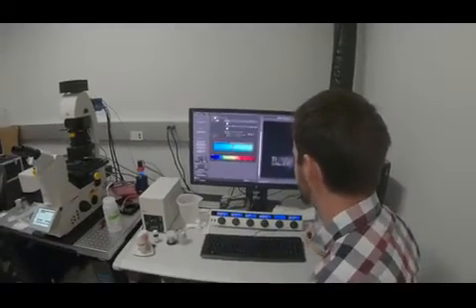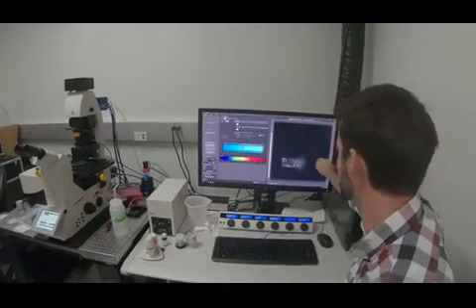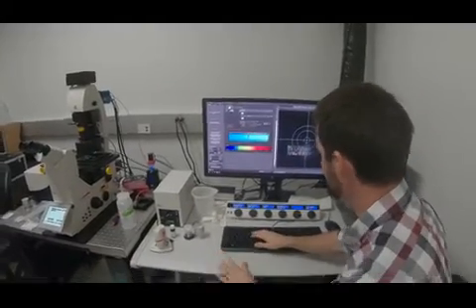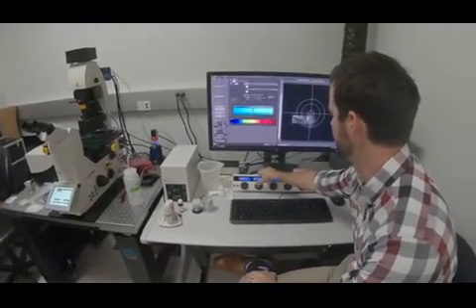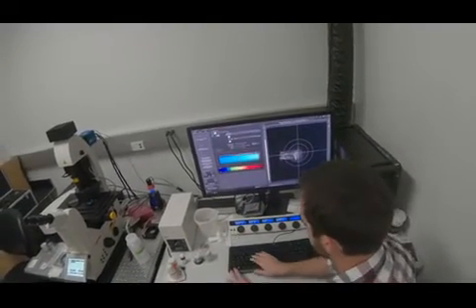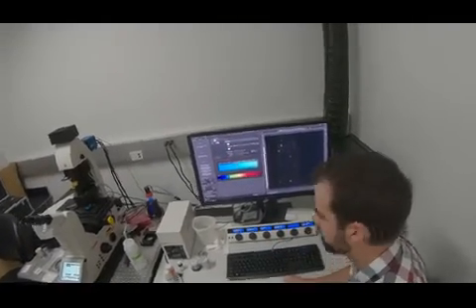So last step is this is like a really zoomed in, squashed light sheet. At the very field of view is here, but we've narrowed it down to be very small. We can center this in the field of view. We can use the target, and we can use light sheet position Y to raise it up until it's centered, like that. Then we can widen the light sheet until it fills the field of view, like that.